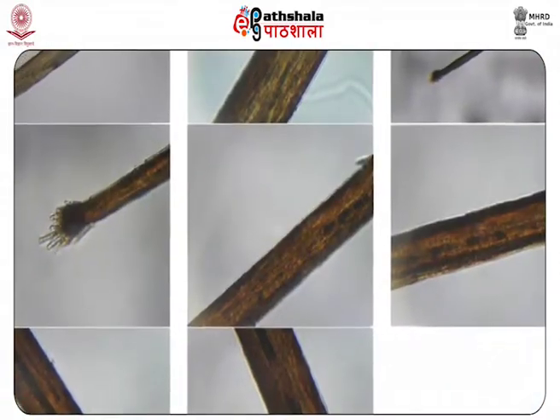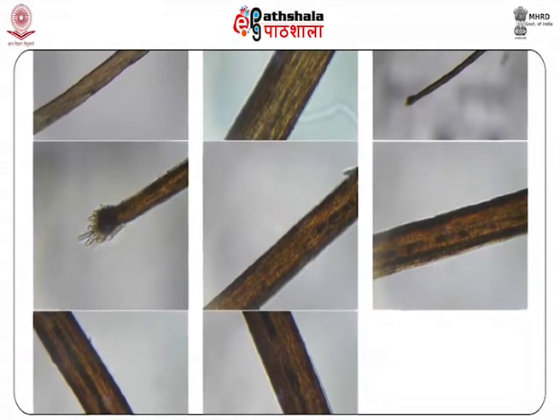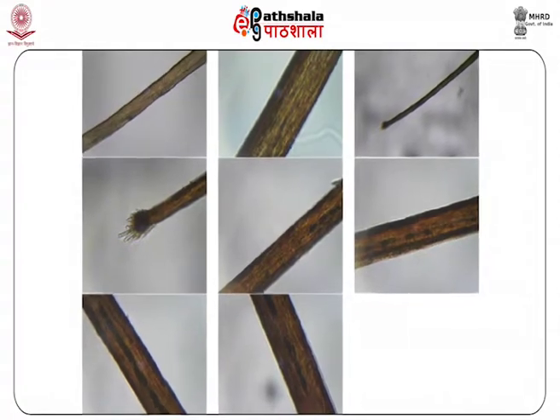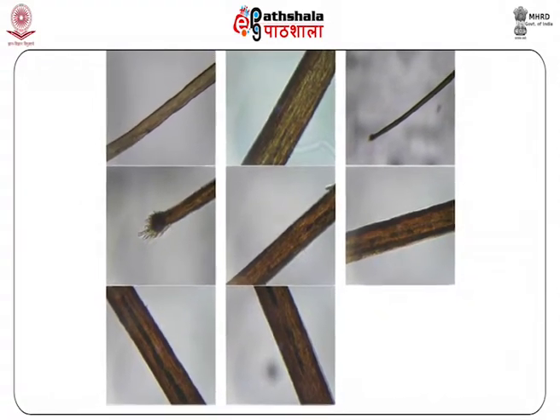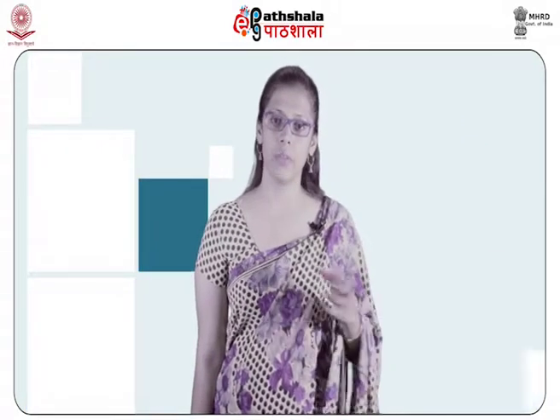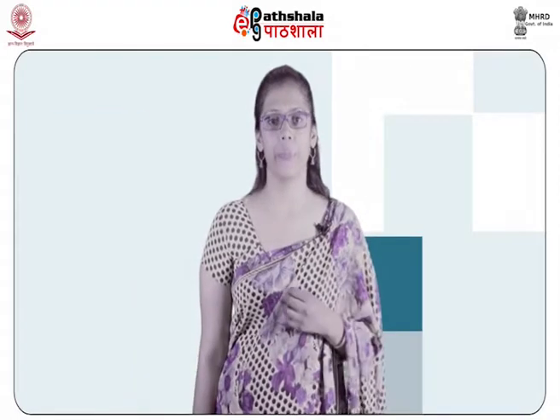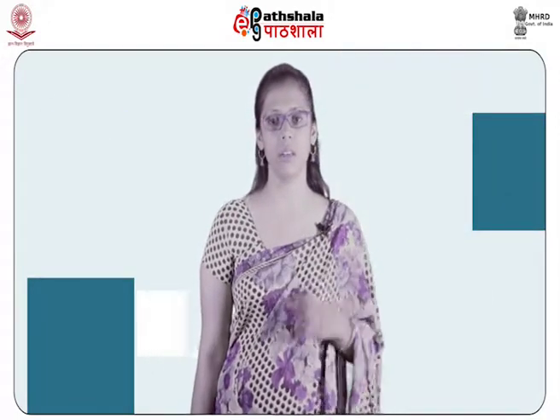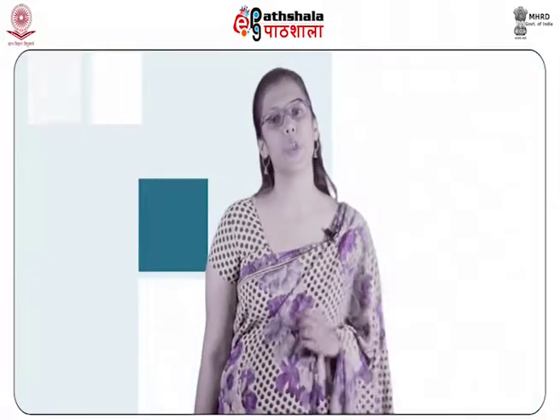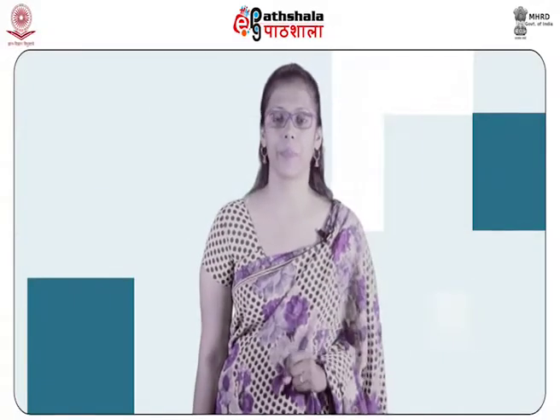Animal hairs found on the surface of physical evidence can relate a suspect or location to a crime of violence. A victim's location in a vehicle or at a site where animals are regularly found frequently results in the transfer of an animal hair to the victim's clothing.